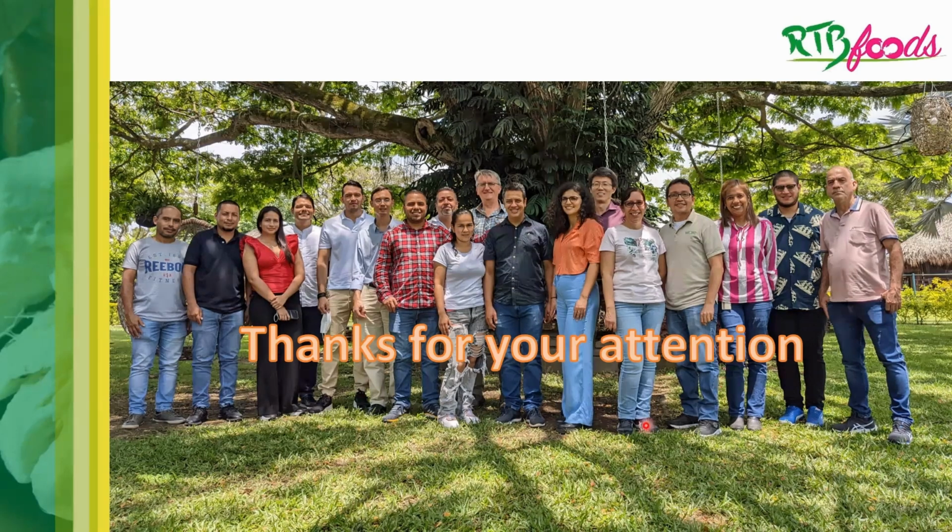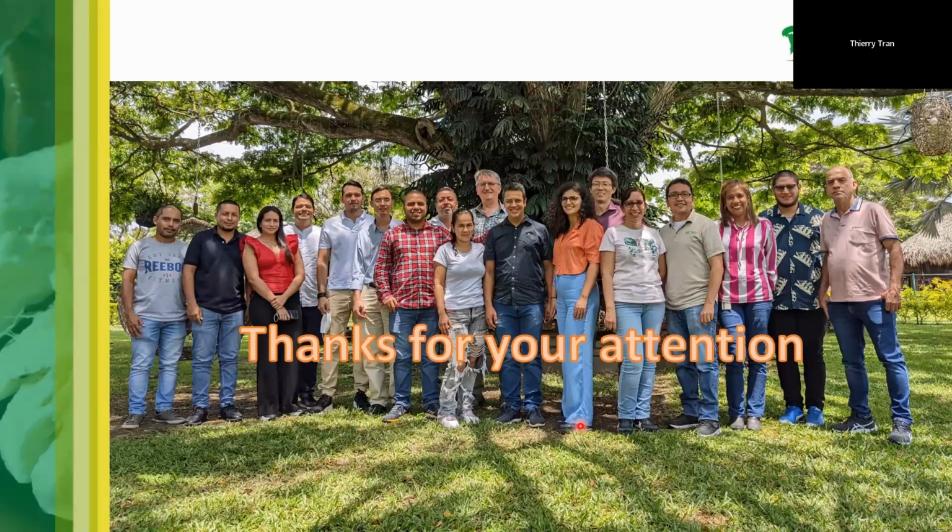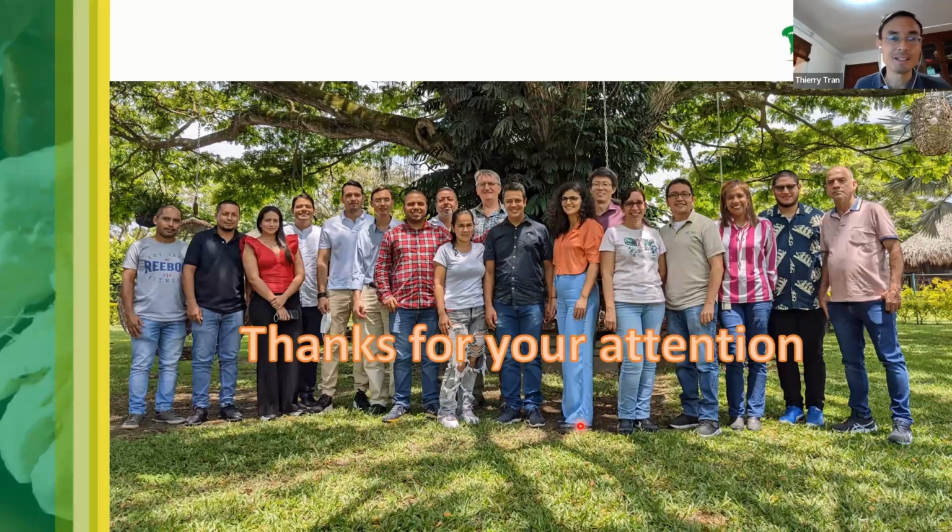Thank you very much. Thank you so much, Luis, for this very useful and detailed presentation. I think it's very promising, the potential to not have to send the samples, the roots to the lab, but just to take the equipment and go to the different locations where we have fields in Colombia or other countries, and be able to record the data and get results directly in the fields. That can save a lot of time and a lot of expenses in sending and shipping samples around.